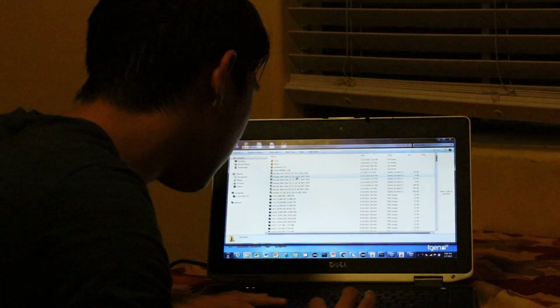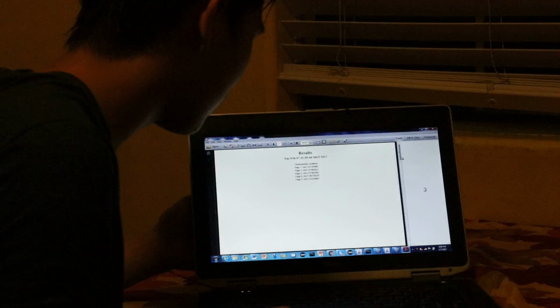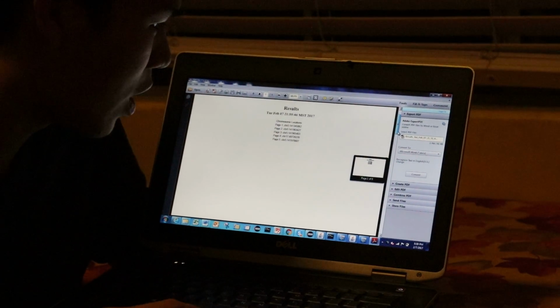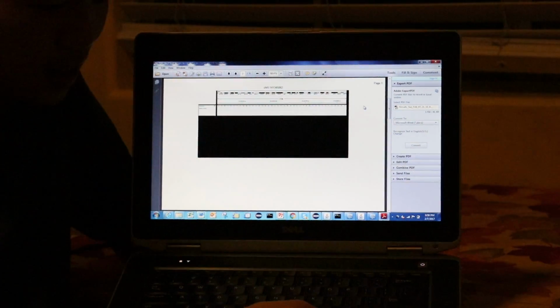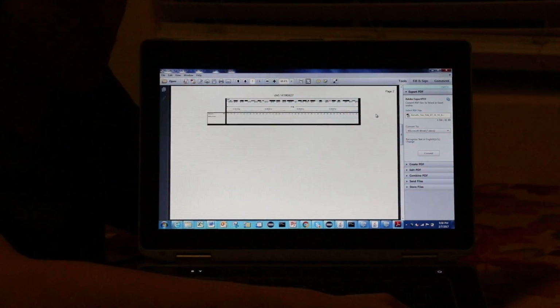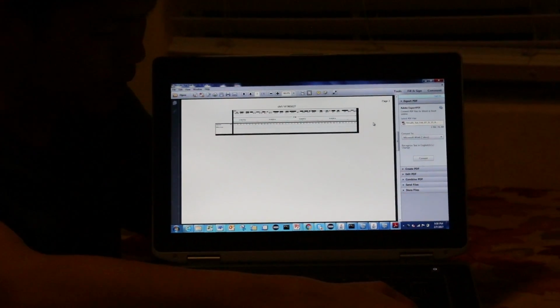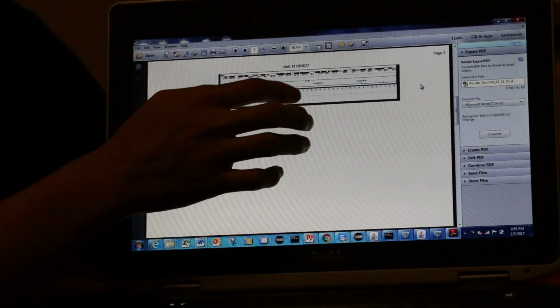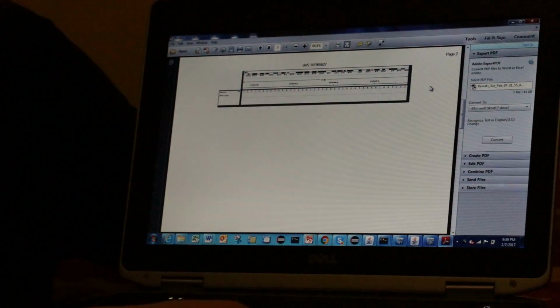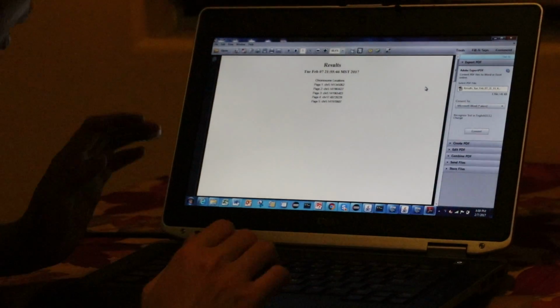This is an example of a PDF report. The one I just created is dated February 7th, 2017. As you can see, these are the snapshots of the different DNA samples for all of the chromosome positions. As you scroll down, you can tell that this sample doesn't really contain a significant mutation, because not a lot of colored bars are showing up, indicating that perhaps this patient is not likely to be tested for cancer. So that's essentially how my program works.